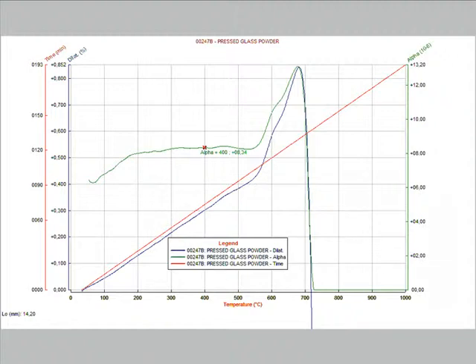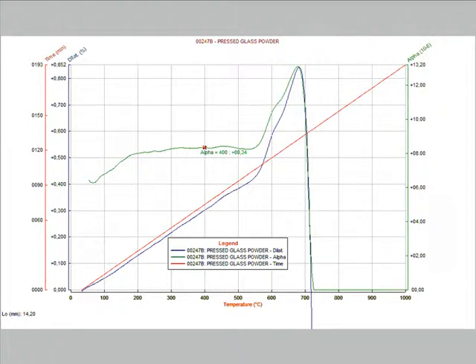The part of the curve after the glass transition temperature which keeps going upward is much wider and no traditional dilatometer can follow the behavior of a glass up to complete melting.